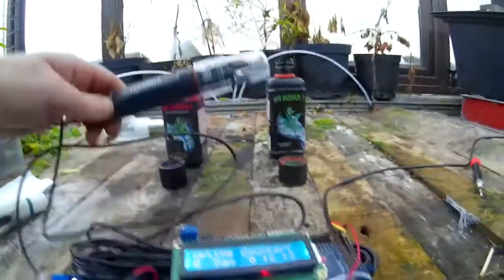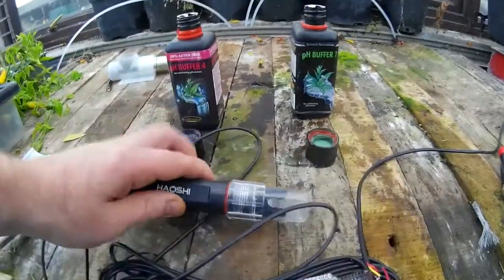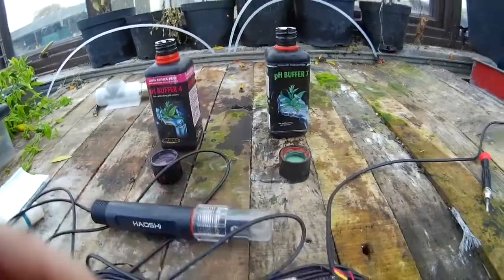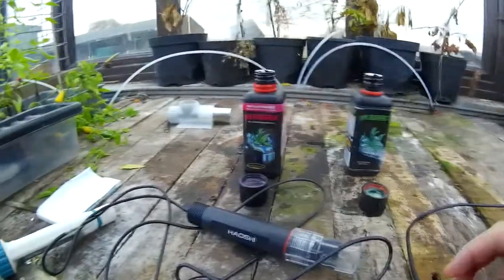DFRobot has been kind enough to send me one of the Pro pH kits. This is essentially a very decent probe which will last a long time, or so they claim. So what do you need to calibrate it? You need your LCD, your Arduino Mega, your pH probe and your analogue kit — wire it up like it's on the screen now.